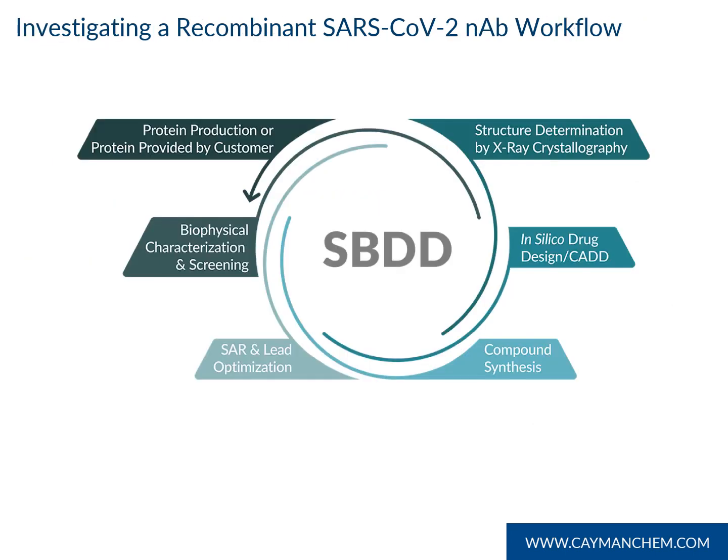In this study here, we wanted to investigate SARS-CoV-2 neutralizing recombinant antibody blocking the S1 RBD-ACE2 interaction using biophysical technique SPR. We made recombinant neutralizing antibody, human ACE2 receptor, and SARS-CoV-2 S1 RBD wild type and variants in-house using our established mammalian expression system. Further characterized their binding via surface plasmon resonance, SPR, using our Biacore instrument.